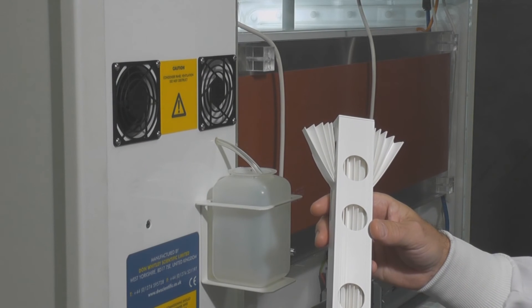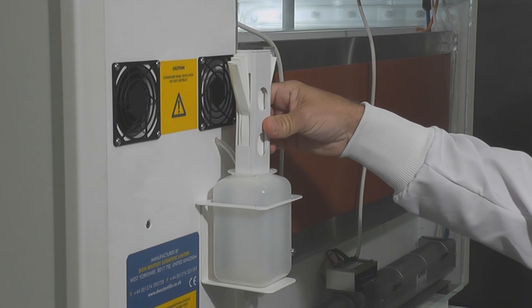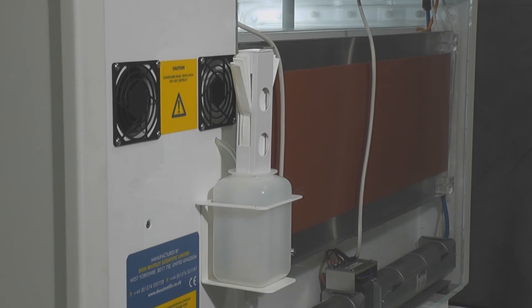The dehumidification system automatically removes excess moisture to a reservoir outside of the workstation. Water collected in the reservoir is evaporated via bacteriostatic wick.